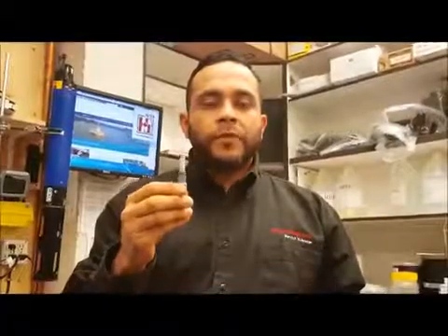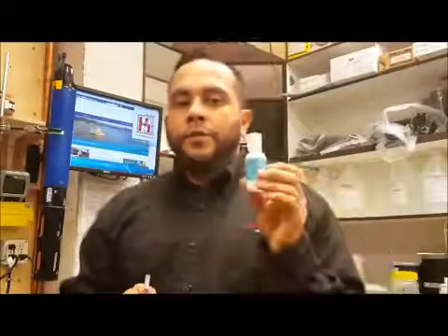Now that we've taken the membrane off of the DO probe, you're going to want to purchase a membrane replacement kit. It will come with six membranes, a sanding disc, and electrolyte solution crystals.